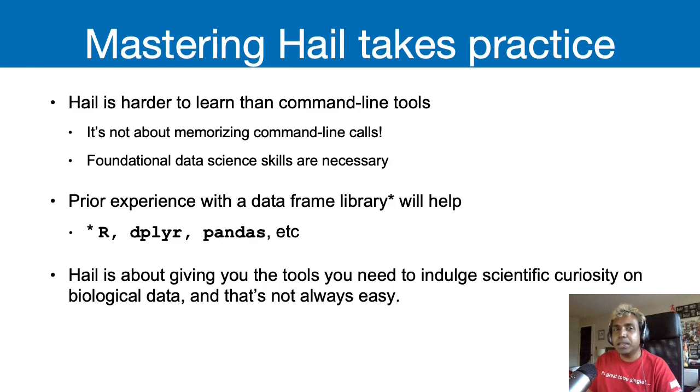And it's, well, I would say it's relative. If you are very comfortable with programming, it's much faster. But if you've only learned simple shell scripting, this may be a little higher or steeper on the learning curve. It is harder to learn compared to most command line tools because it's not just about memorizing command line calls. You have to understand the foundation of data science skills in order to use the commands that would allow you to slice and dice your data.